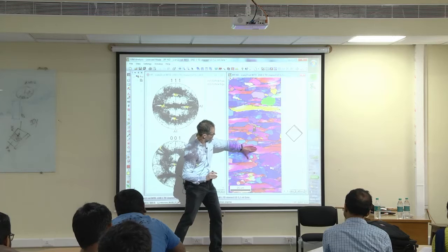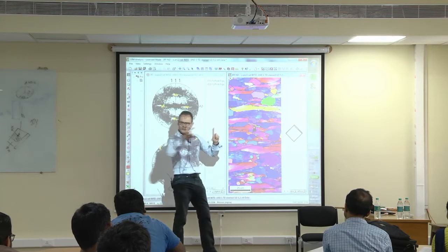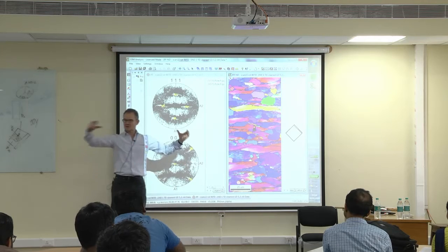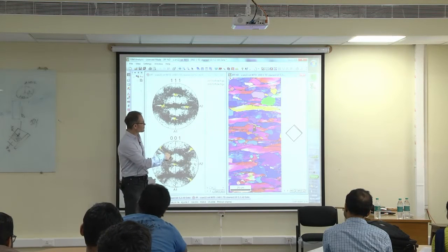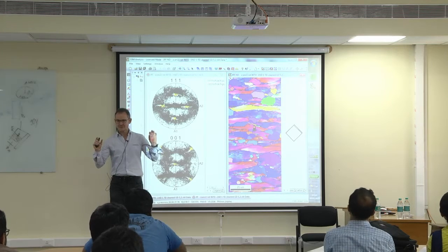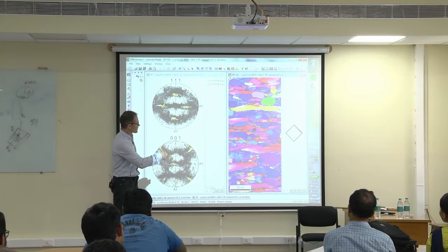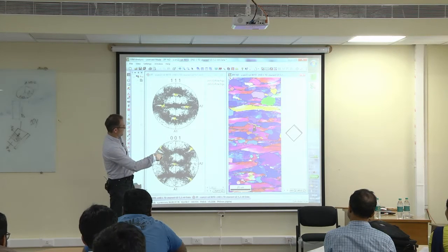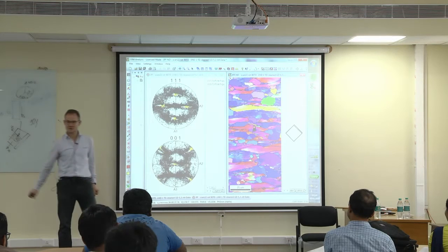It starts yellowish, then it turns red, red, red, but there is no separation inside. Yeah? In the red grains, there is a homogeneous orientation gradient, while in the blue grains, it seems to be discrete. You seem to have recovery. There seems to be some sort of recovery going on. Here it's as well very clear, yeah? Well, this red grain or this one here has quite a homogeneous structure.